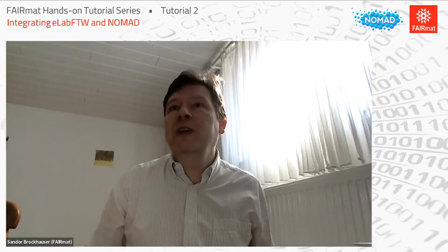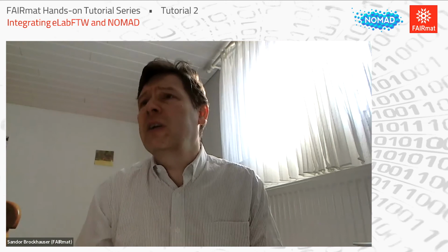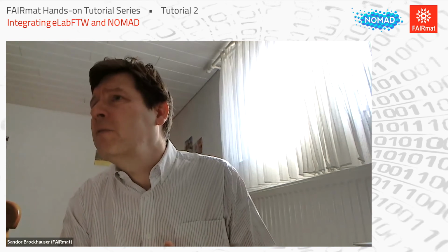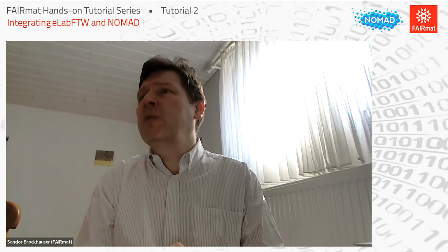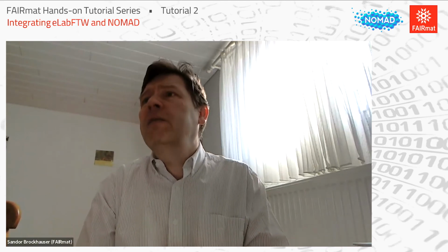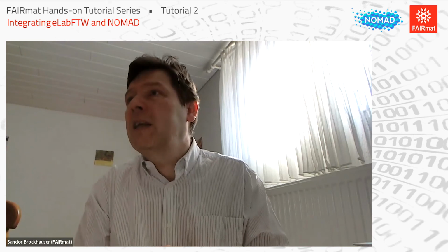Thank you, Sherjeel. Very nice demonstration. And actually, we are now ready for the questions. There were some questions in the chat, which has been partially answered by Pepe. That was one question: if these extra fields defined in the JSON are reachable via the API, and indeed they are.